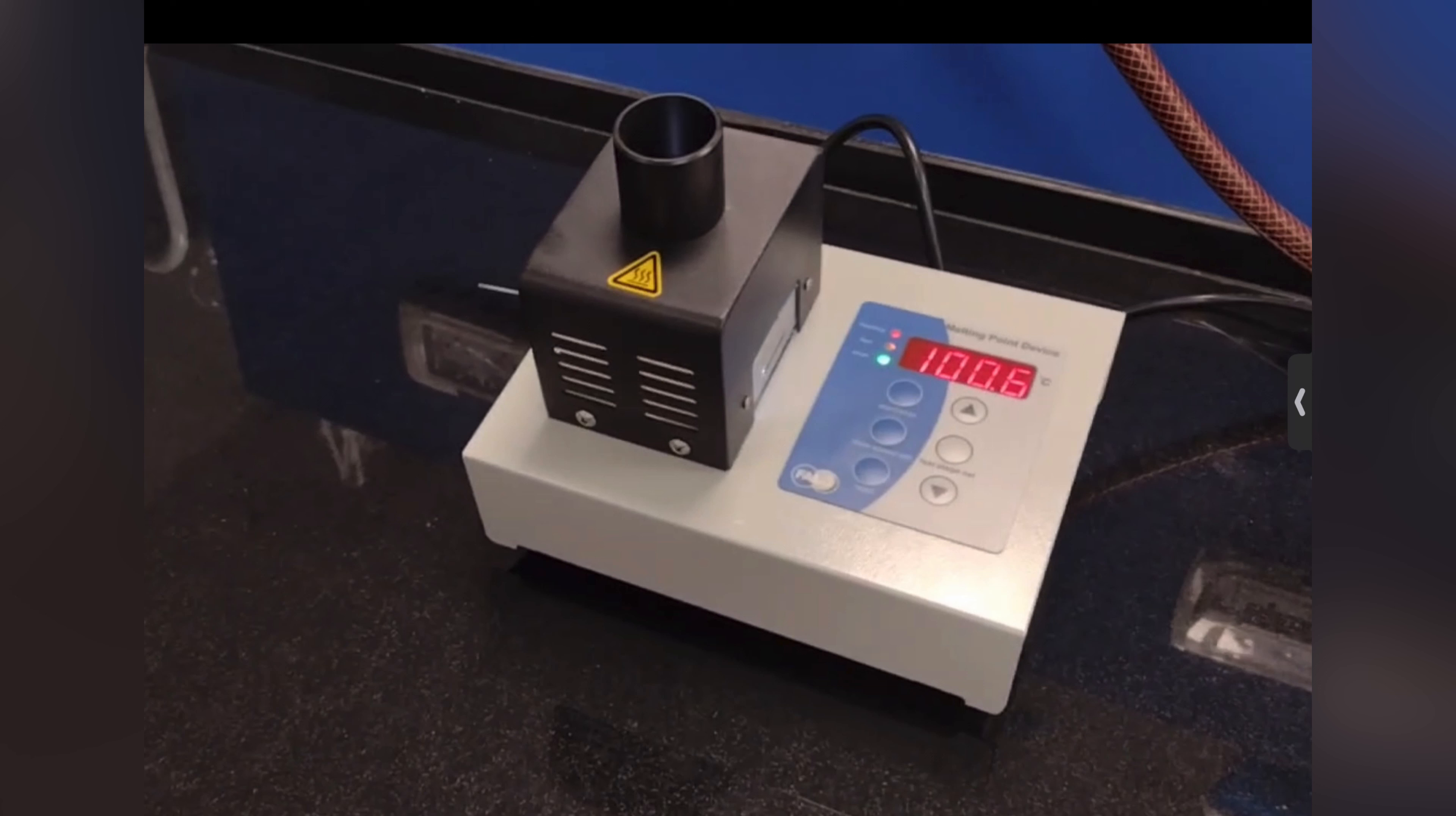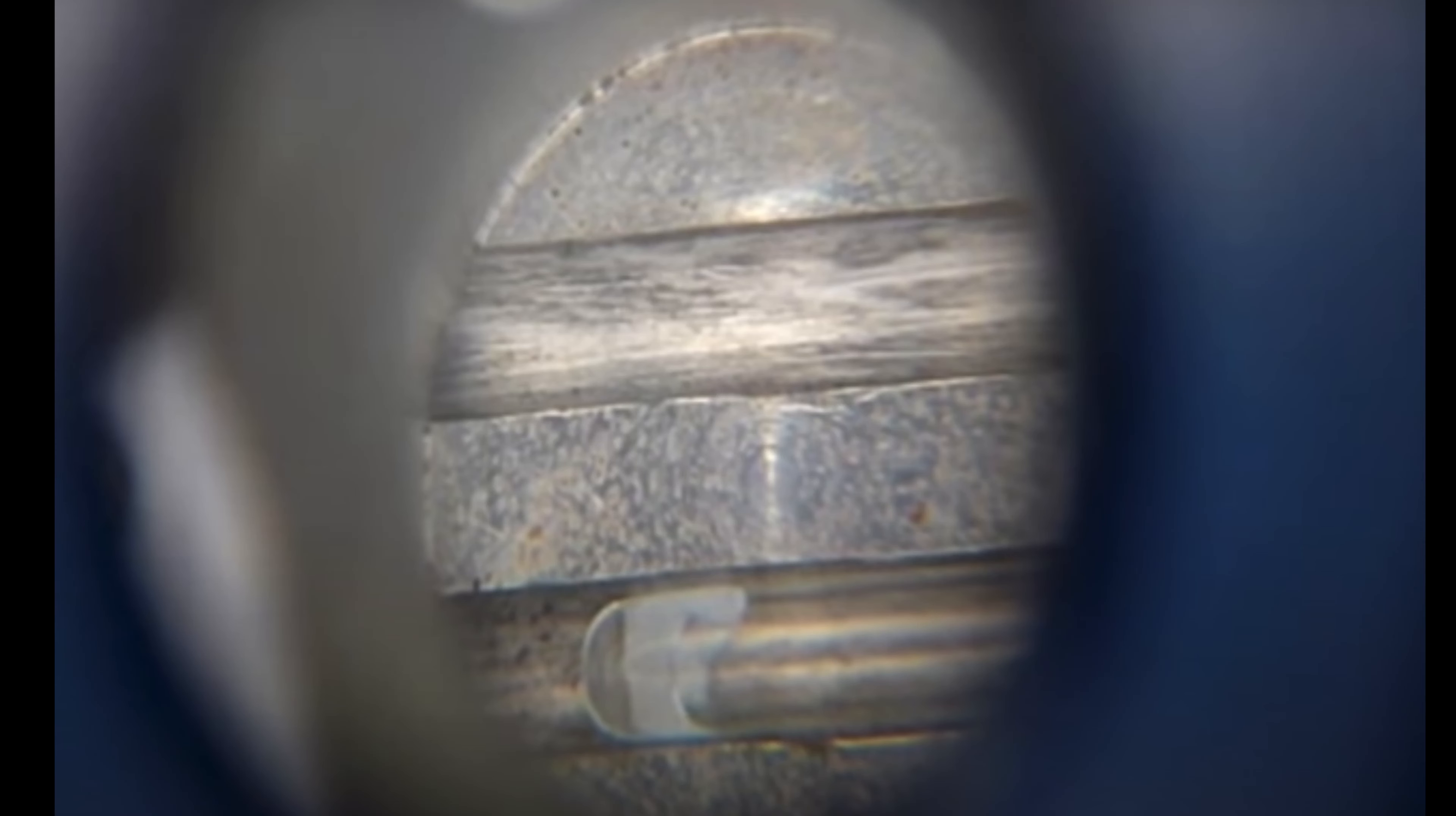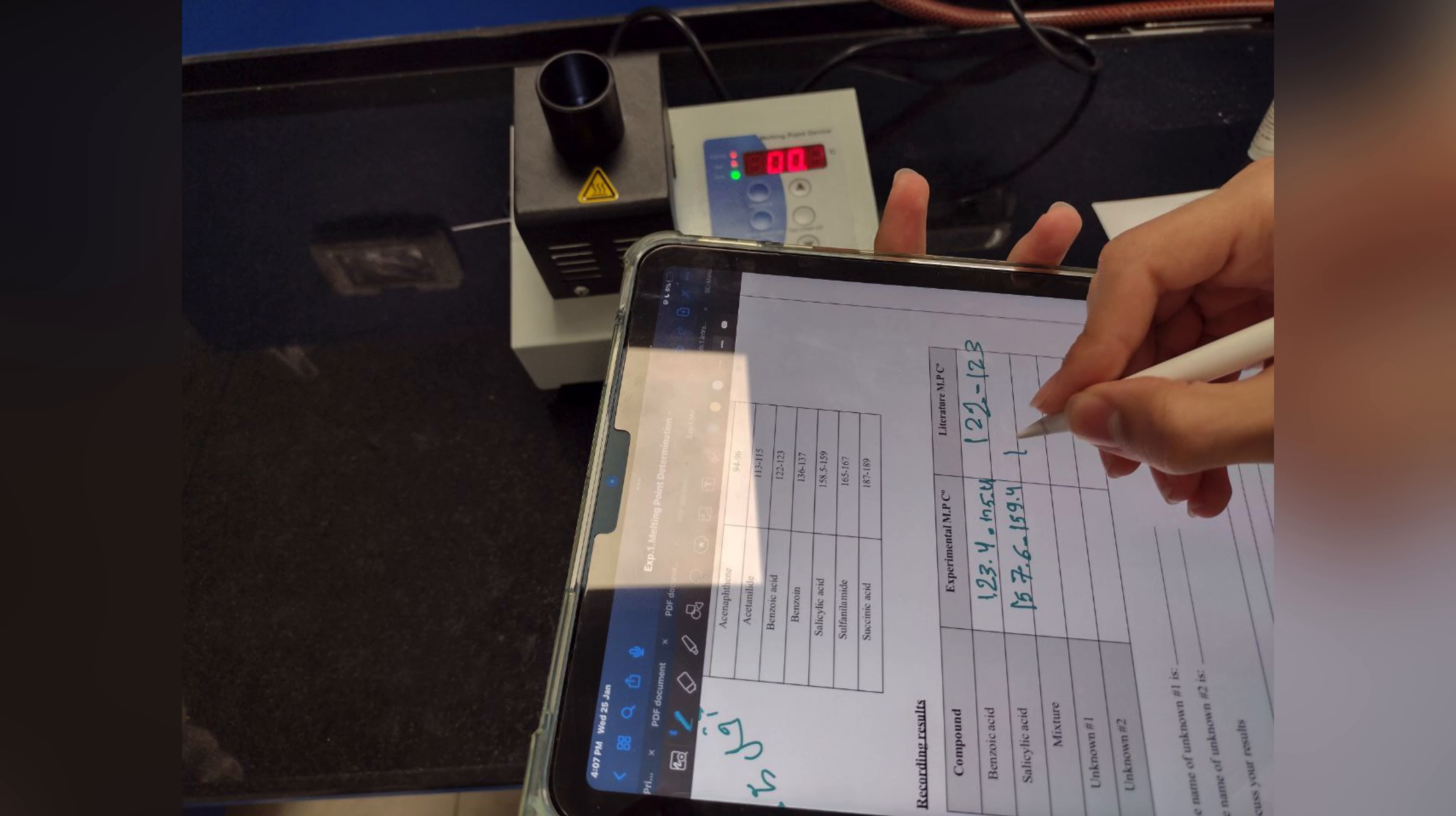The temperature was rising quickly until it beeps and it has been put on slow speed. After noticing the melting of the sample, the data has been recorded.